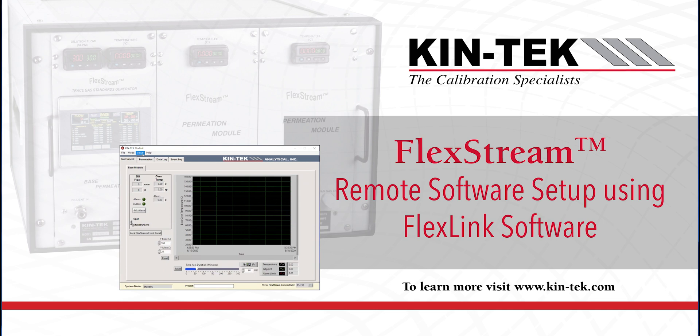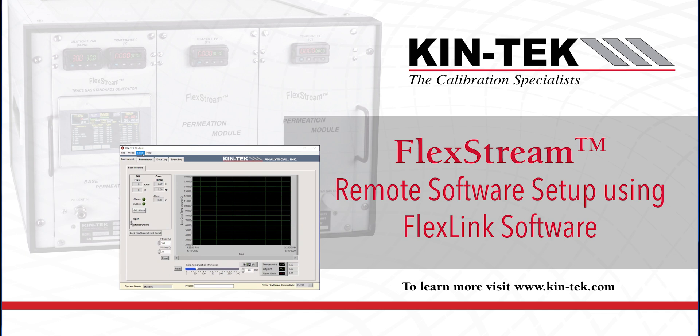Hi everybody, Denae Brazel here, Vice President of Kintec Analytical. I'm going to do a quick tutorial, a series of tutorials related to our software that we provide free of charge with our FlexStream calibration system. So our gas standard generator for calibrating an analyzer.